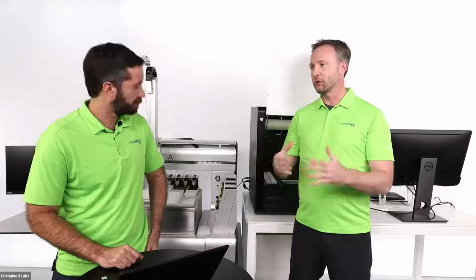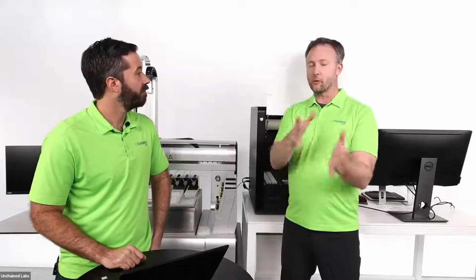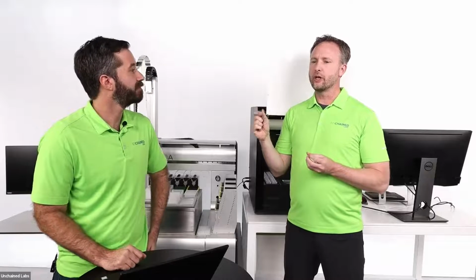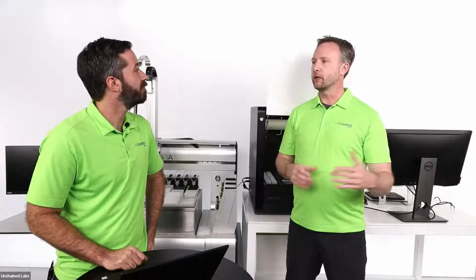If you look at the specs for it, we take standard IgG, I think, that we published the specifications to, but it is true that with your samples you may have different results. I don't know about your specific samples, but I've seen with other customers who've used Big Tuna and Unagi with proteins or monoclonal antibodies in that concentration range, they're still getting high 80s to low 90% recovery rates. So maybe not exactly 96%, but better than what has been reported to us when they run it on their centrifuge spin columns.